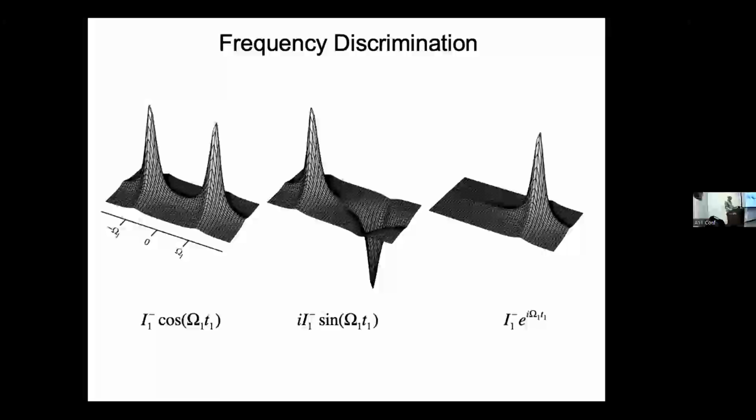But in a trial spectrum, if you put the carrier where you know you're on one edge, then you know I should see the frequencies all positive or the frequencies all negative. Once you figure that out, you can put the carrier back in the middle. Yeah, we once deposited a carbonyl spectrum upside down and then had to correct it.